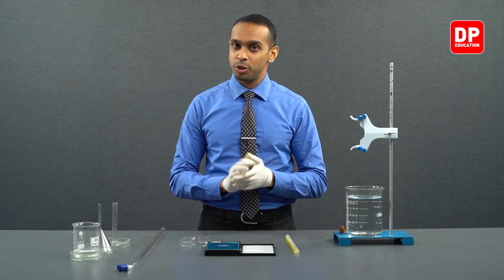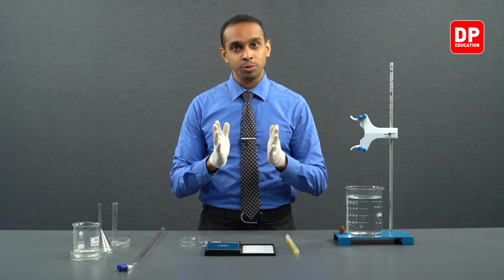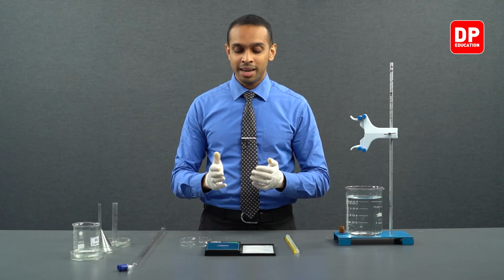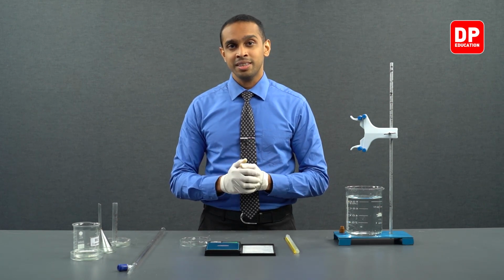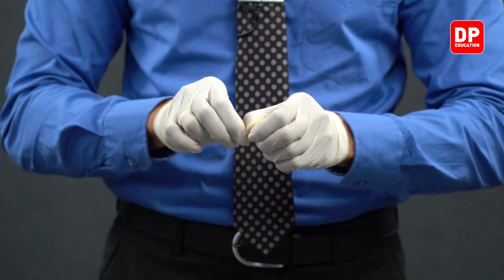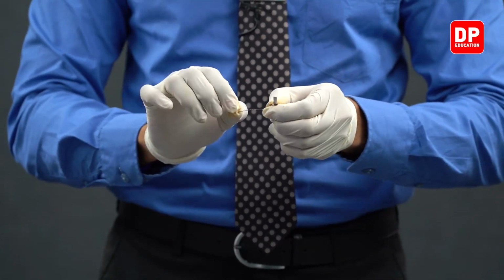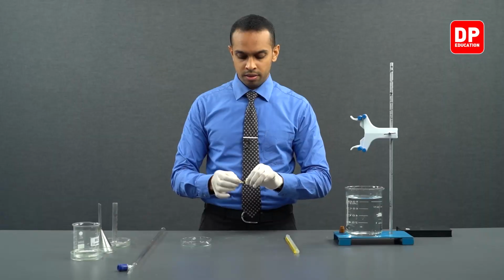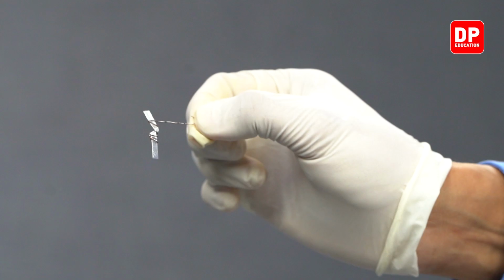We have to make sure that we note down this mass of the magnesium strip that we used for the second trial, so that when it comes to the calculations, it will be easier. Now, let's move on to tying this magnesium strip onto a piece of copper wire and then adding it into the burette. We have tied it onto our copper wire. After tying it with our copper wire, we can place it aside.